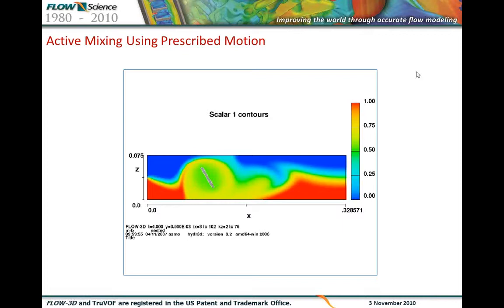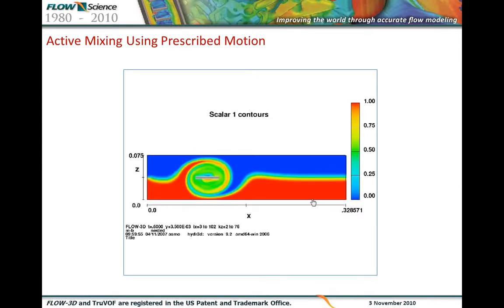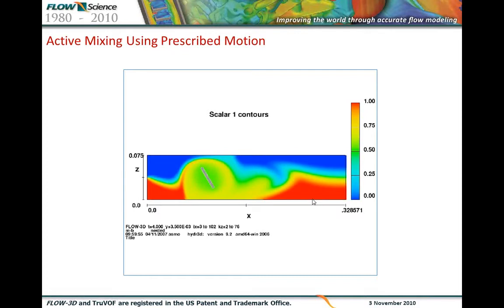The two streams of the fluid come in from the left boundary and mix because of the stir bar, and then they leave from the right boundary. I'm going to play this animation again. Now regarding the physics here, the simulation is set up as a one fluid case where one stream carries a scalar array. In this case, there's no density variation.